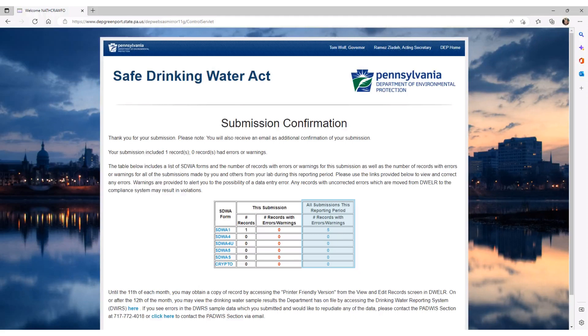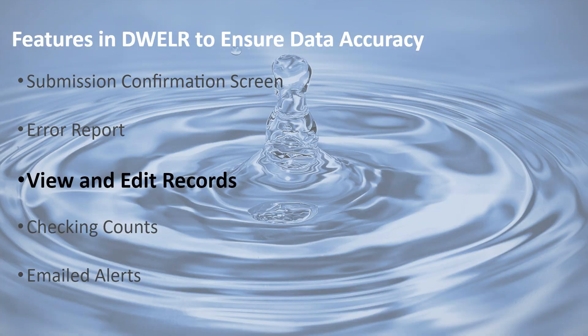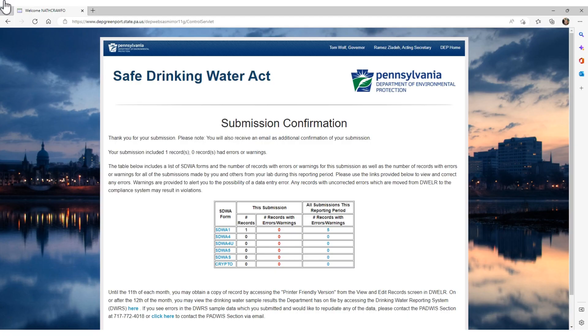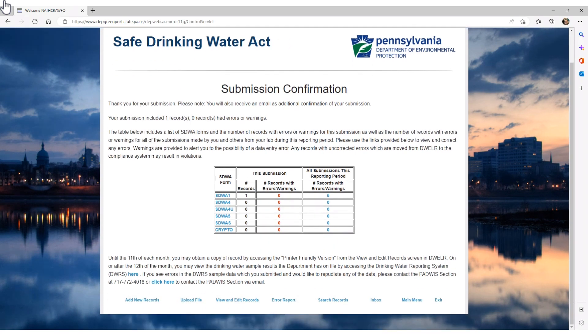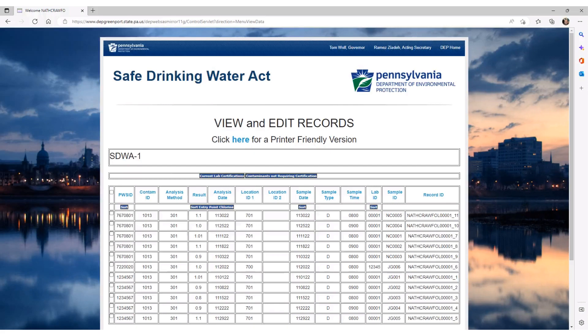The next DWELLR feature we will talk about is how you can view and edit any of your records. Another way to verify that you have entered accurate data into DWELLR is through the View and Edit Records page. You can access this page from the Submission Confirmation screen by clicking the View and Edit Records button. This is the View and Edit Records screen. It shows all records that have been entered into DWELLR for the current reporting period by a user associated with your laboratory ID. It is highly recommended to print a copy of your submission so that you can review your data for accuracy. To do this, click the word 'here' at the top of the View and Edit Records page to create the printer-friendly version.